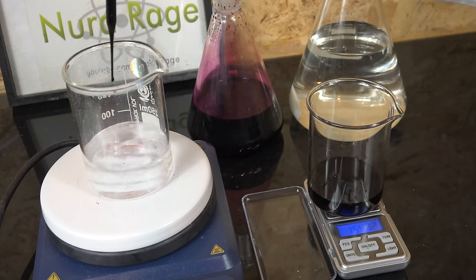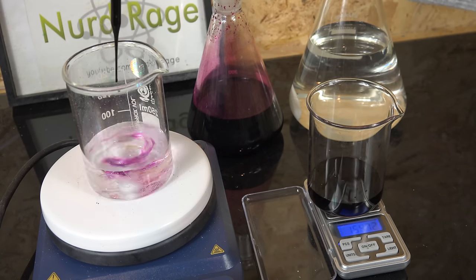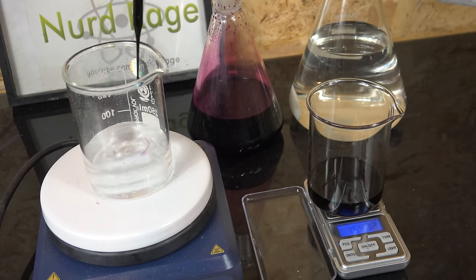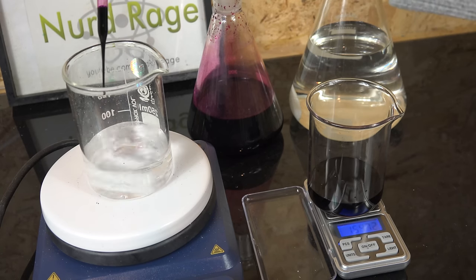Greetings fellow nerds. In this video we're going to use titration to find the concentration of hydrogen peroxide. After decades of experiments on this channel, we're finally going to do what most chemists are actually paid to do: analytical chemistry.